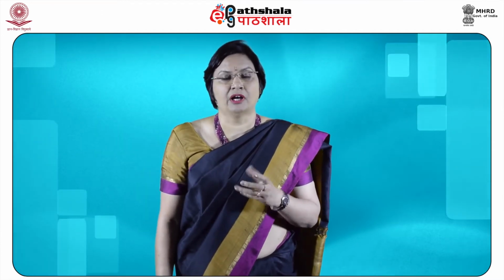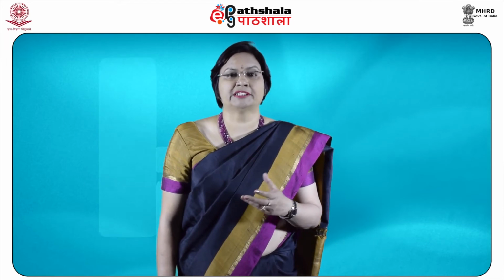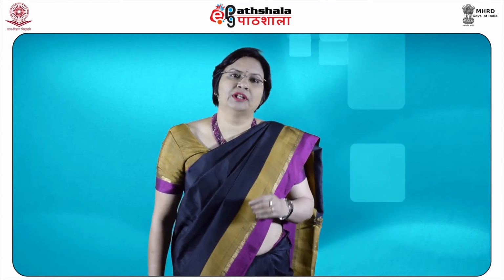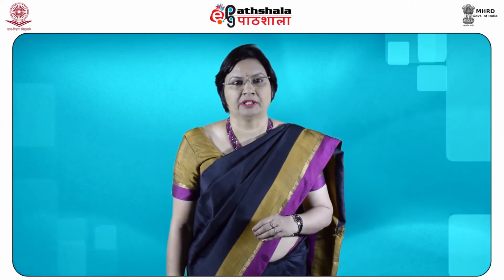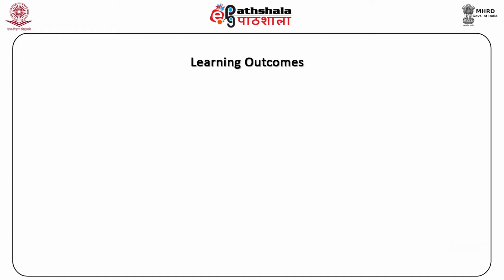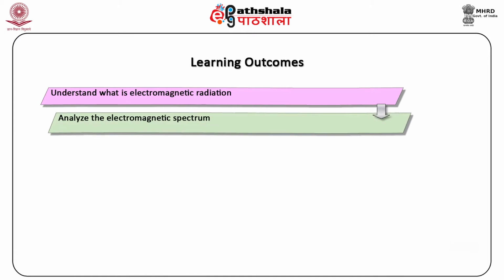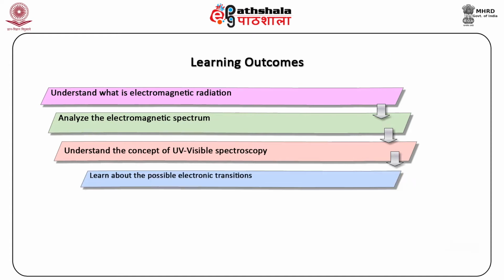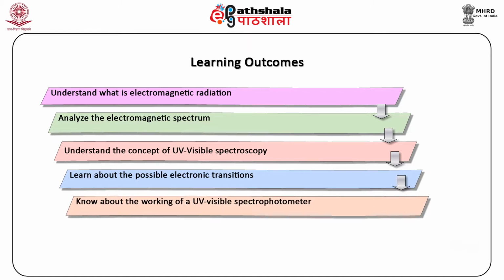But yes, we will begin with simple examples and slowly we will develop how to find out the structure of complex molecules. So, with this background, let us begin the study of the first module. So, dear students, let us try to know the learning outcomes of this very first module of the paper, which is organic spectroscopy. After studying this module, you shall be able to understand the electromagnetic radiation, analyze the electromagnetic spectrum, understand the concept of UV visible spectroscopy, learn possible electronic transitions, and also know the working of the UV visible spectrophotometer.